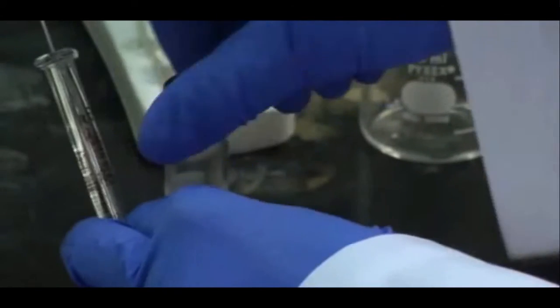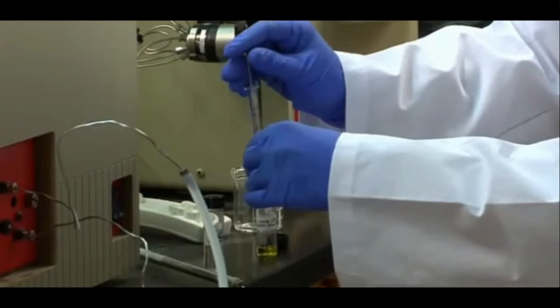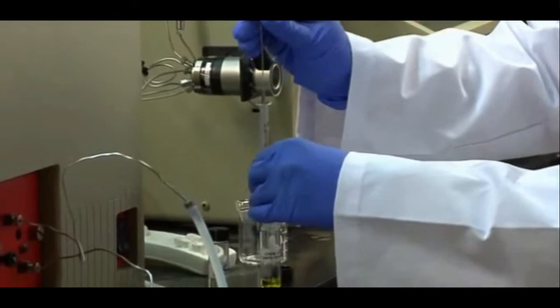Once that's clean, you're also going to rinse with your standard sample solution to make sure it's of a consistent concentration. You can rinse about once or twice — usually there's not too much to spare.